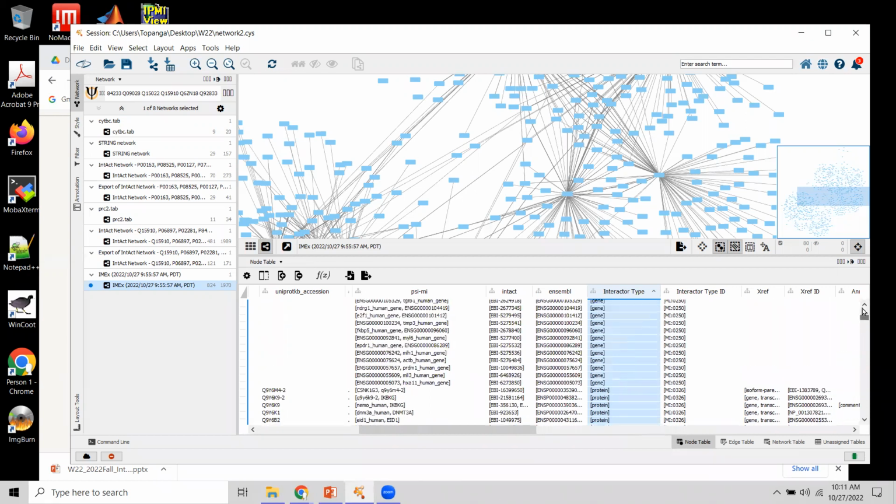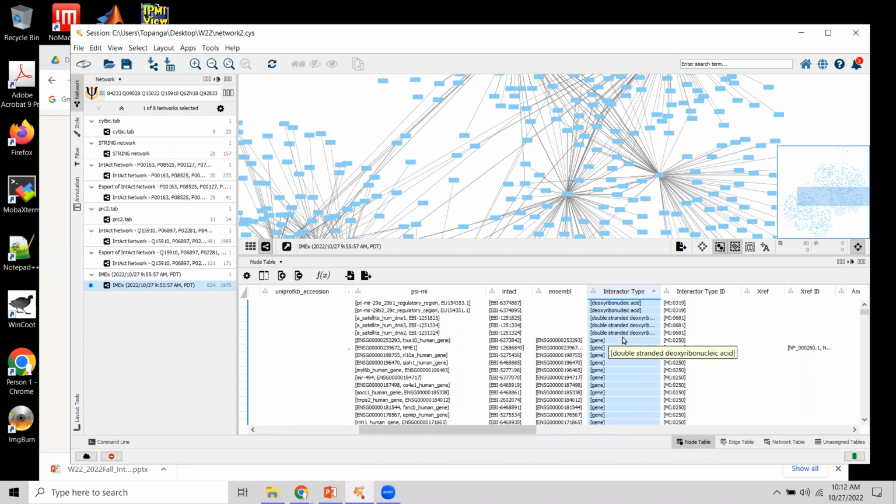Okay, and if we check after sorting, we're getting a few positions reporting a few interactors being actually pieces of DNA, either double or single stranded. In this case, we've got either unqualified or double-stranded DNA. We might have a case of a gene. Those are probably experiments that are chromatin immunoprecipitations or ChIP or whatever.